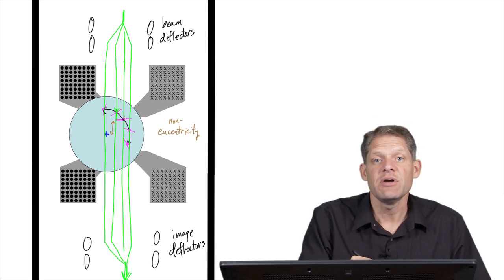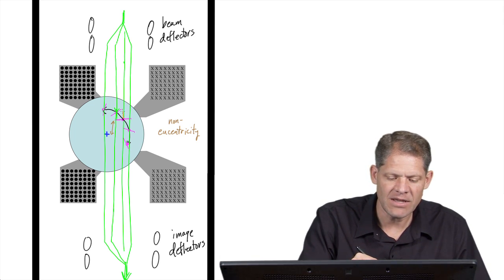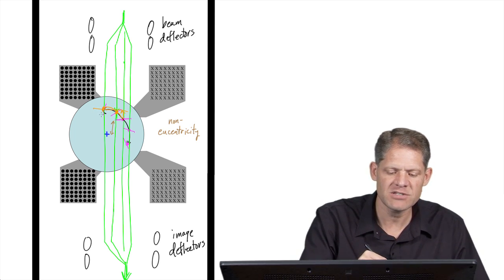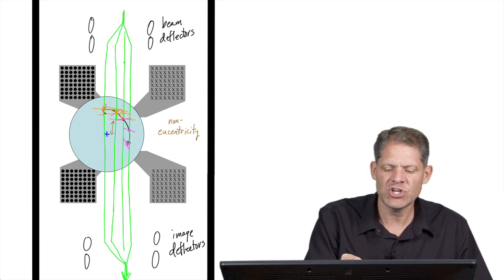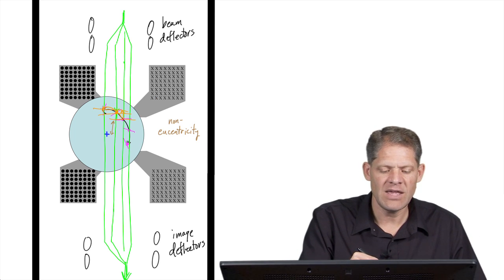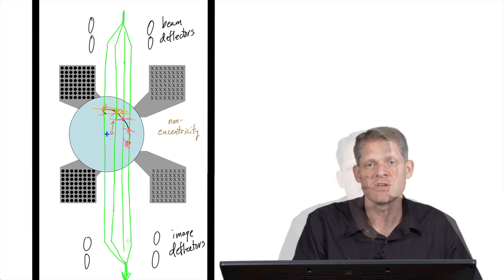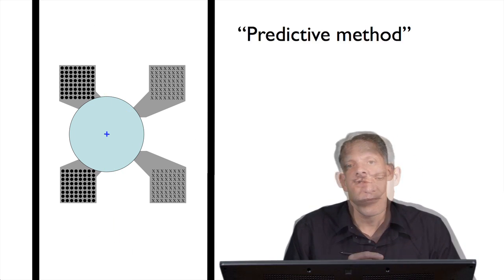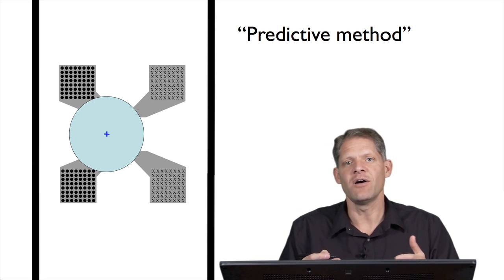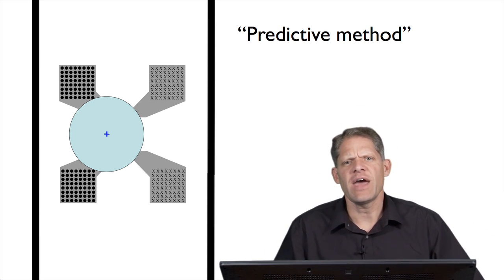Now, in addition to shifting left and right, we also see that our image is rising in the microscope. As it moves up here, it rises. And so in order to maintain a constant focus, we have to change the current in the objective lens, which is focus, so that even though the sample is moving up and down in the column, each of our pictures of the tilt series will have the same focus value. So to record a tilt series, in between each image, there's a number of deflector and lens adjustments that have to be made. And there's a couple different strategies to go about this.